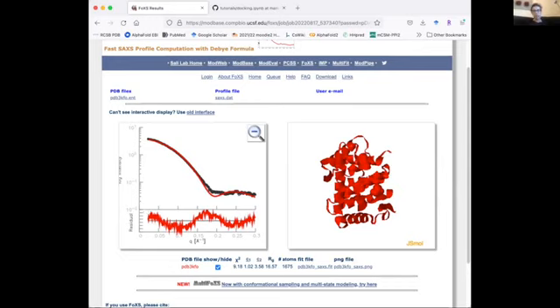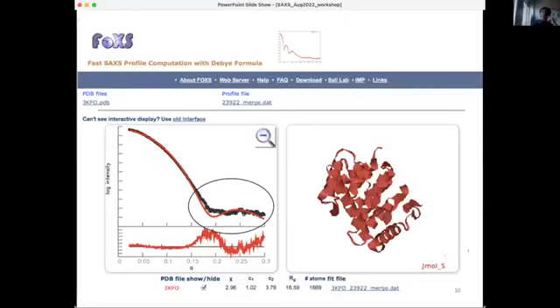And so what happens is that this protein doesn't have a histag. So let's add the histag. So how can you add the histag? Anyone has ideas? Using AlphaFold? Yes, that's probably the default today. Yeah, because it's so automatized, you can really grab it. Yes, it's so easy to use AlphaFold to add the histag.